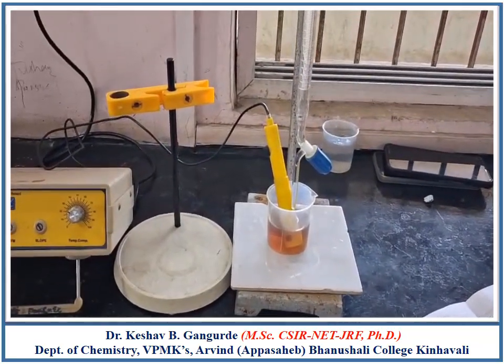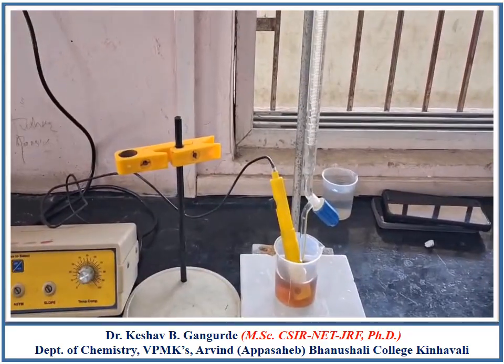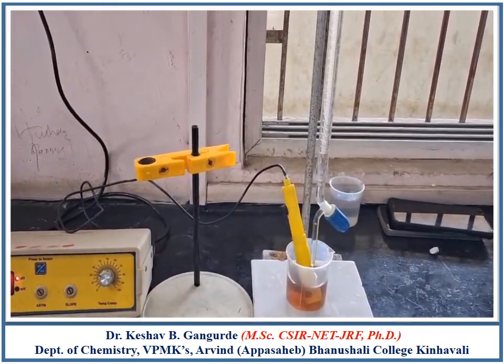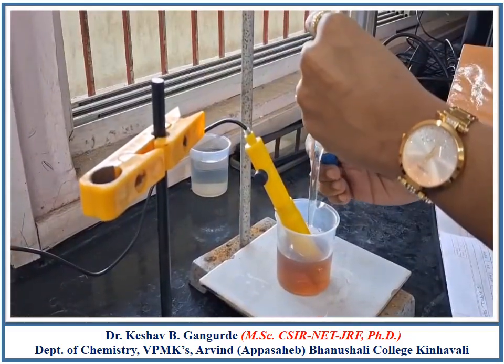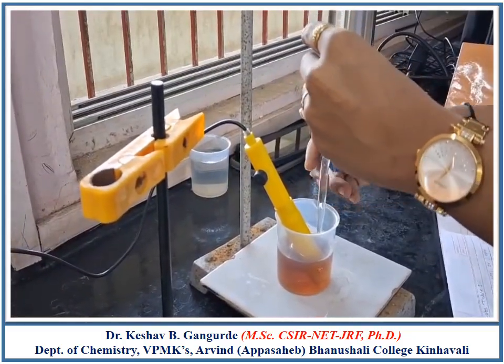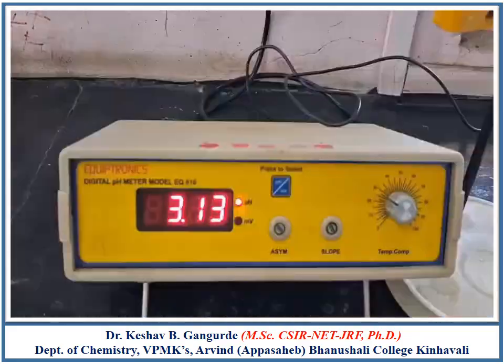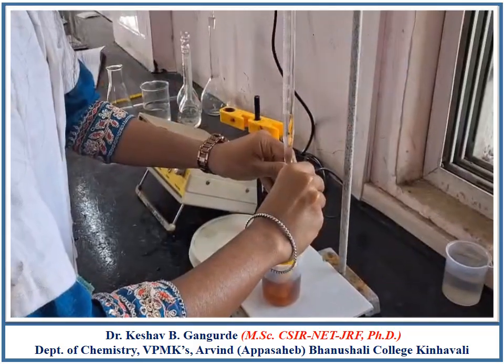Now do the titration of cola sample with NaOH filled in the burette, in 0.5 ml installments at a time. Add NaOH in 0.5 ml installments and stir the solution. The pH reading will increase. Note it down.